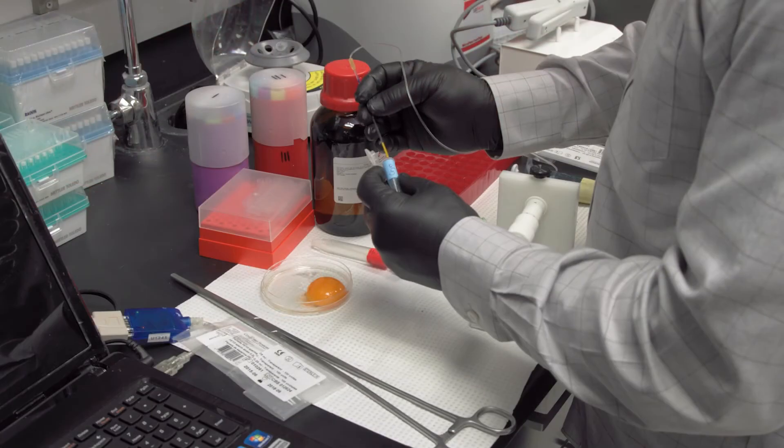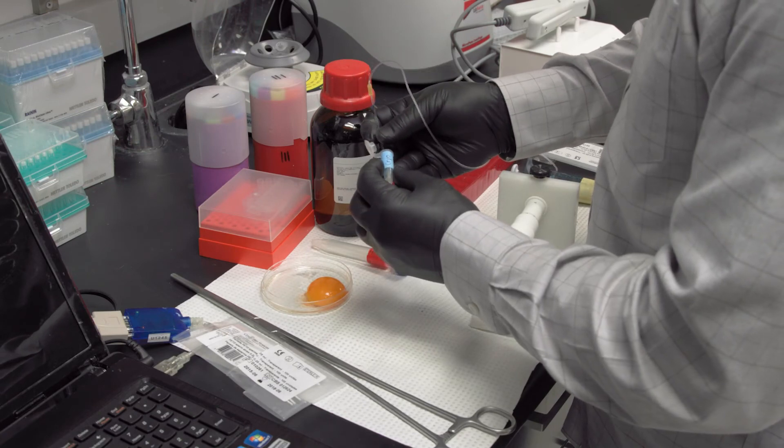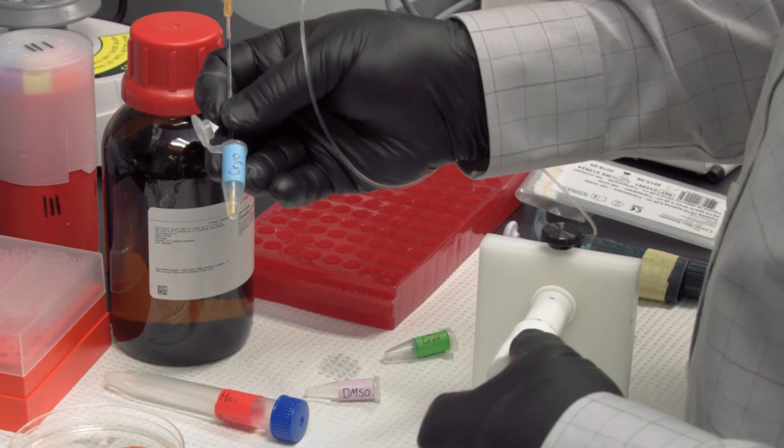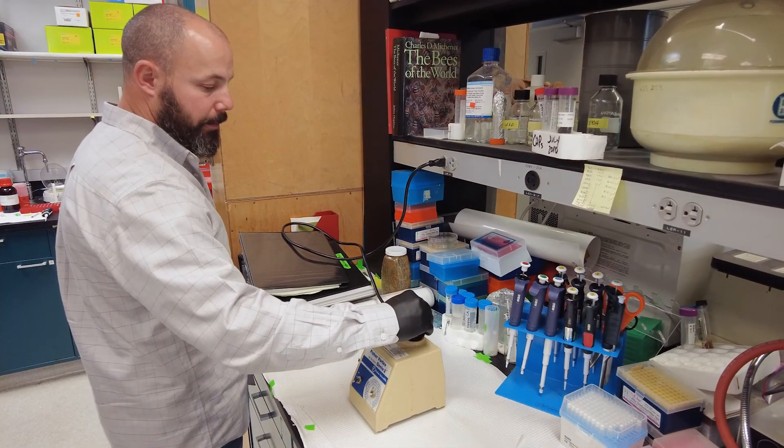Our cryopreservation solution is composed of three components: 50% Harbo's buffer, 25% egg yolk, and 25% DMSO.